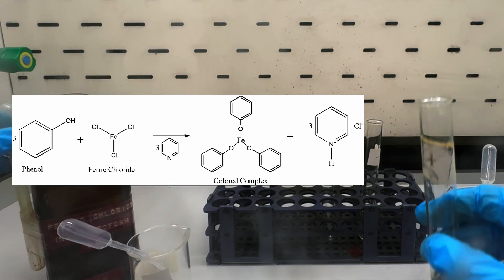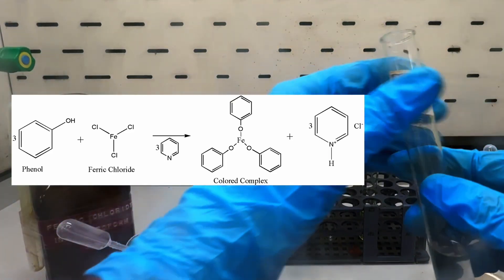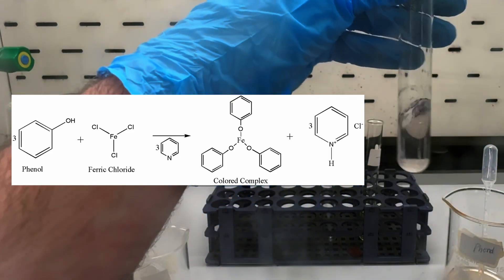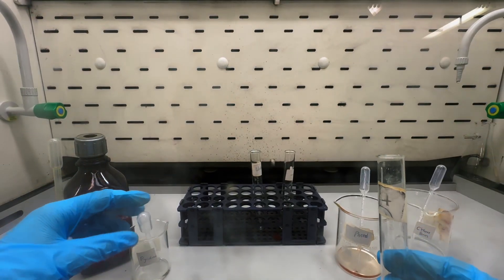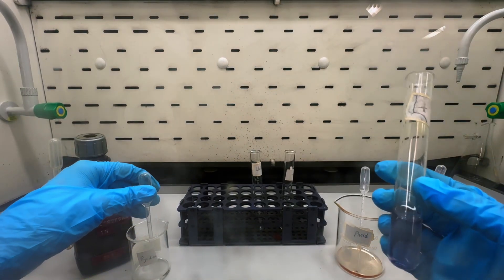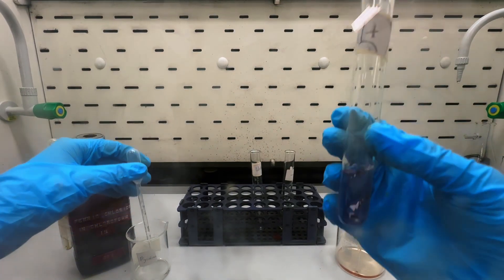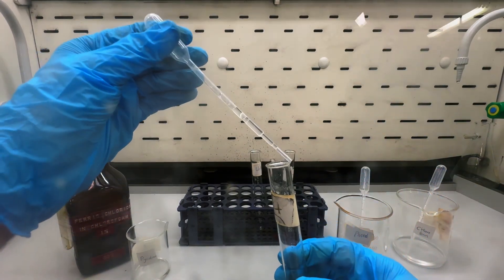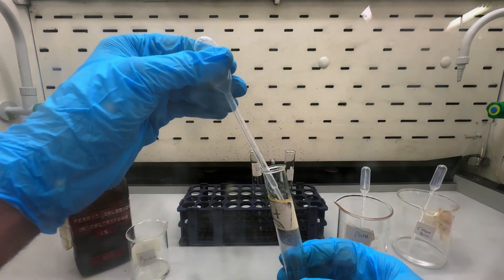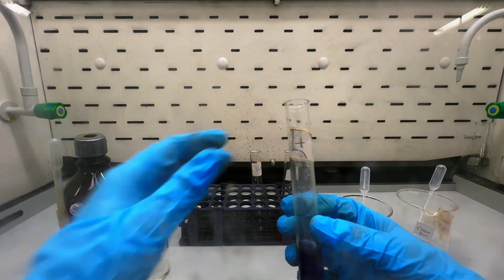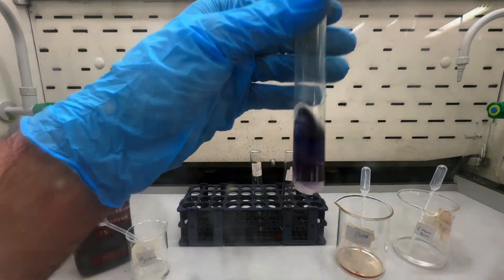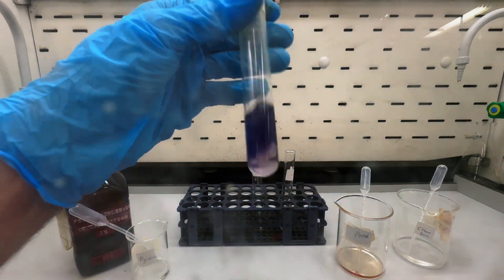The general reaction behind this chemical test is the ferric chloride reacts with 3 phenol molecules, as well as 3 pyridine molecules, to yield the colored complex, usually blue in color when phenols are present, as you can see in the test tube right now.